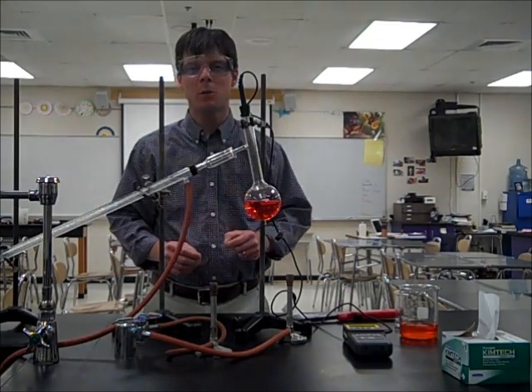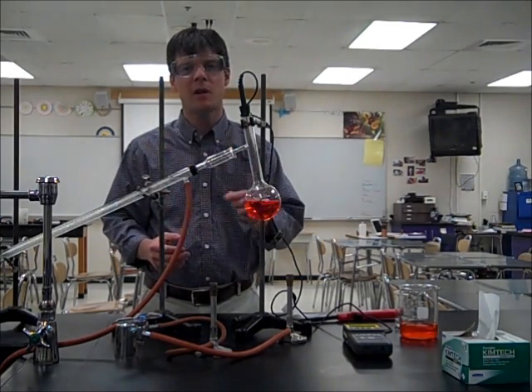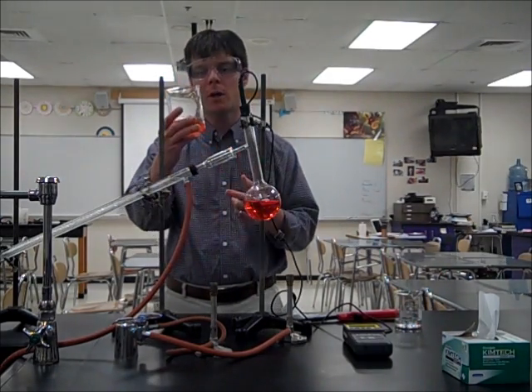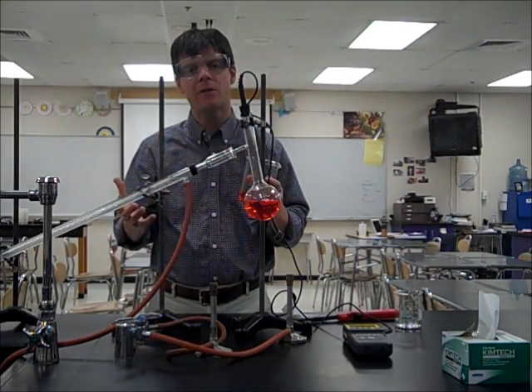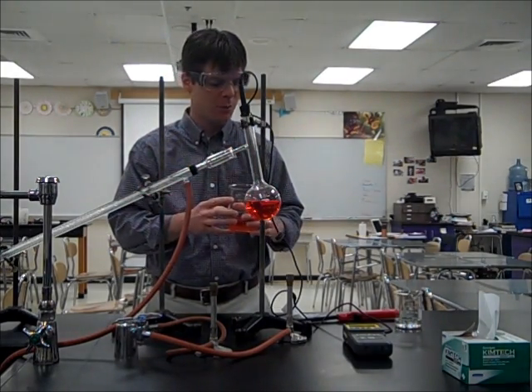Hi everyone. In this demonstration we're going to be looking at the process of distillation. Distillation can be used to separate the components of a solution. The solution that we're going to be working with is a solution of salt water. I've also added some red food coloring, and you're going to see what happens to that during the distillation process.